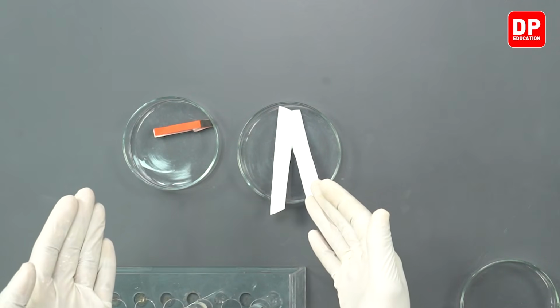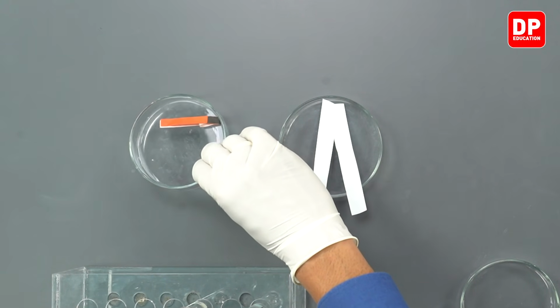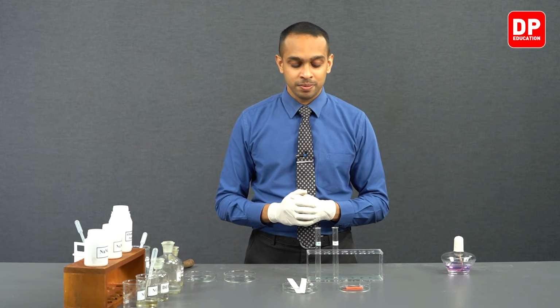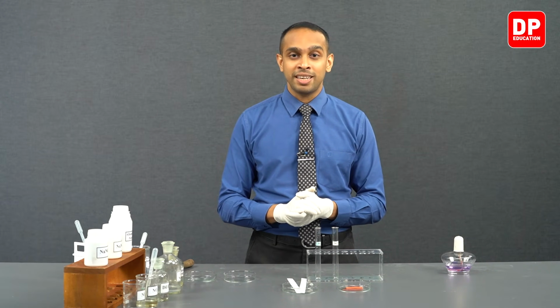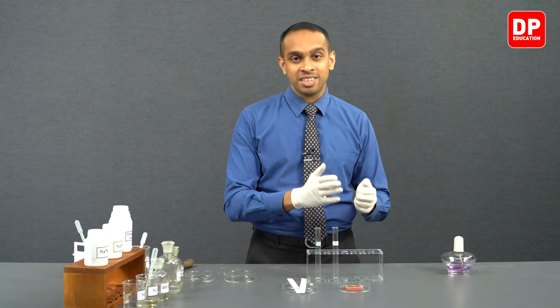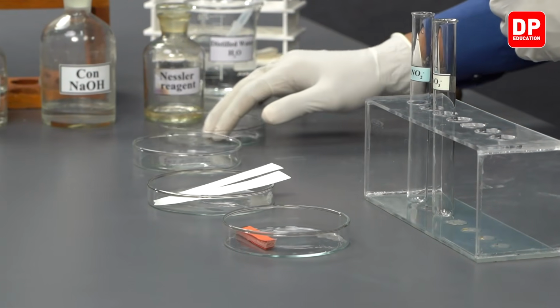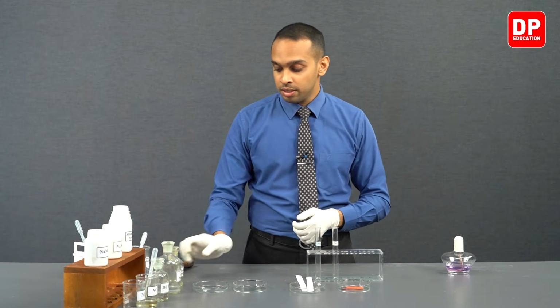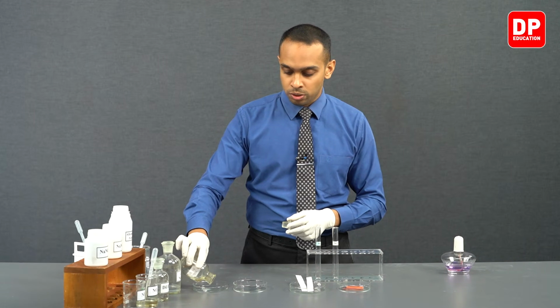So we have both of them in front of us. We have two pieces of filter paper as well as red litmus paper. We are going to use them to identify the presence of ammonia that is released when we add sodium hydroxide and aluminium to each of these nitrite ion solutions and nitrate ion solutions. So let's first take two petri dishes and prepare our filter papers. So we have Nessler's reagent here. We'll add a little bit of Nessler's reagent onto one petri dish.